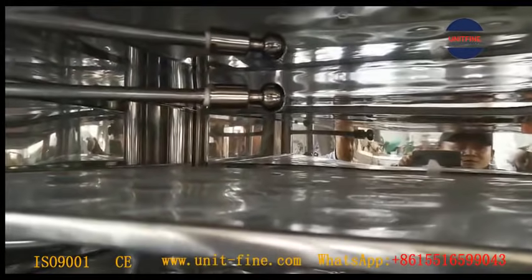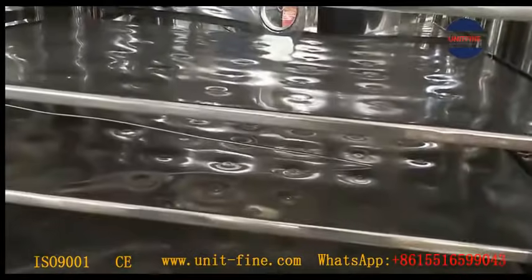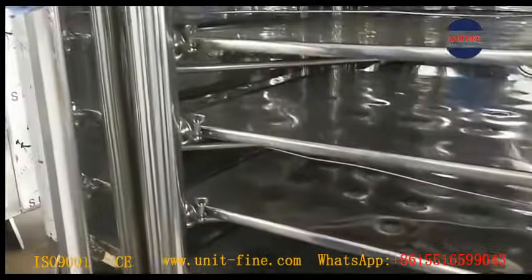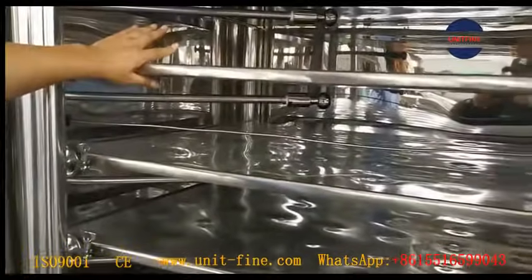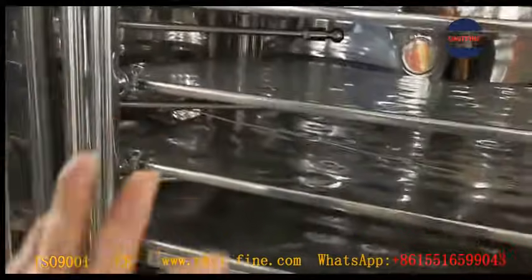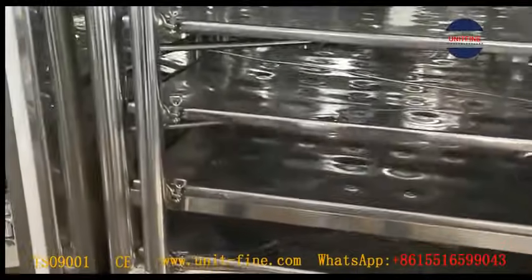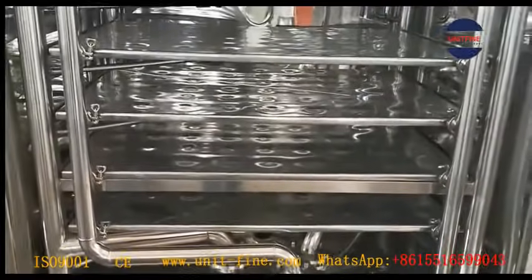Also, what could be seen is that there is a rotating spray nozzle on each layer. That's part of the CIP system. Apart from the rotating nozzle, there is a fixed spray nozzle at every corner to spray some dead corners as much as possible. Totally there are 21-piece spray nozzles.